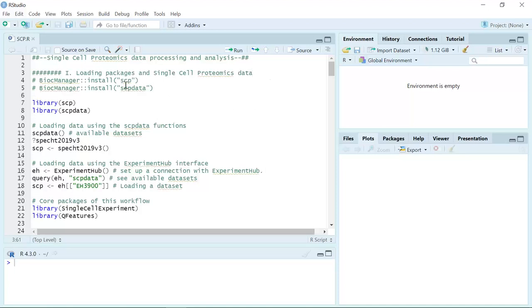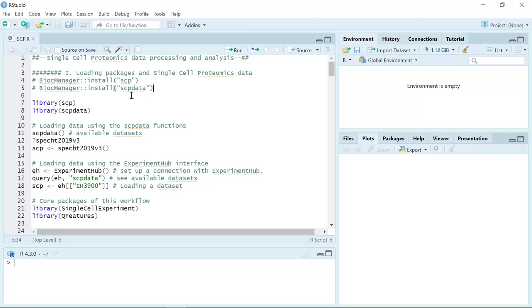First, you need to install the SCP package. For the video tutorial we are going to use the simplified data set, which is included in the SCP package. If you want to use the full data set, you will also need to install the package SCPdata. The SCPdata package contains 18 single-cell proteomics data sets, and we will show you how to look at the 18 data sets in this package.